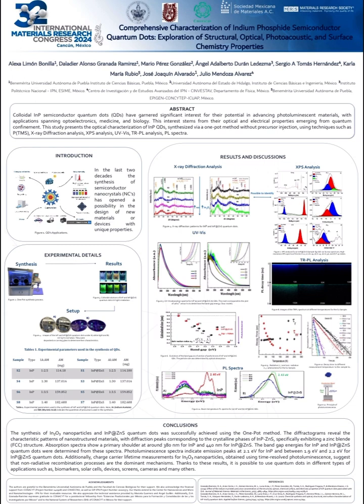And now, as a result of all this experimentation, we have the characterization of the quantum dots. First, as we all know, X-ray diffraction analysis is useful to analyze the structure of materials, and as we can see in our diffractograms, it was possible to identify the presence of indium phosphide, indium oxide, and zinc sulfide.